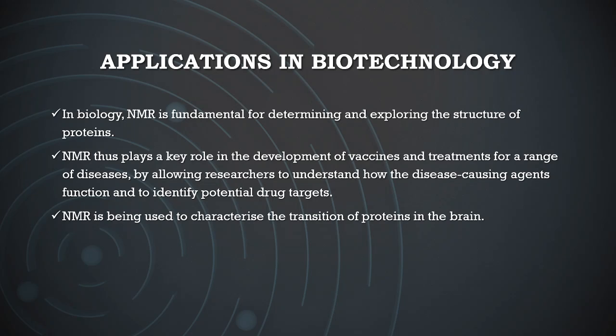NMR plays a key role in the development of vaccines and treatments for a range of diseases including HIV, influenza, tuberculosis, and cancer by allowing researchers to understand how the disease-causing agents function and to identify potential drug targets. NMR also provides a powerful tool for studying conformational changes in proteins and chemical kinetic processes, which enables the mode of action of enzymes, transporters, and proteins to be elucidated at the molecular level.